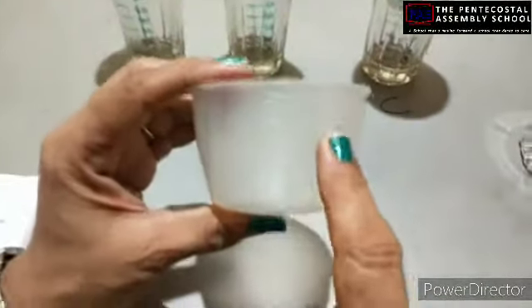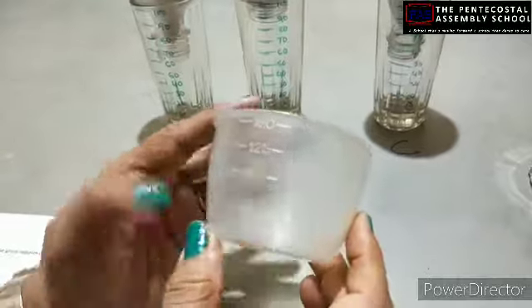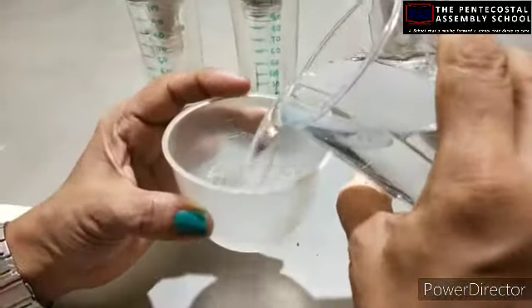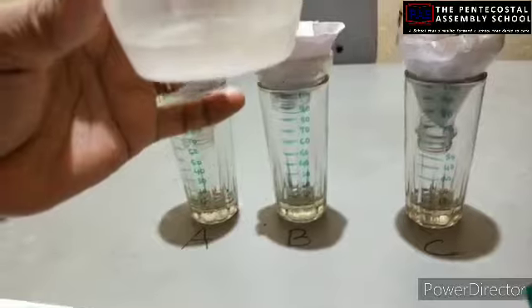So I am taking one measuring cylinder. Here it is marked. You can see the marking is there for milliliters: 40, 80, 120, 180. What we need is to take an equal amount of water for each of these. So this is up to 40 ml.